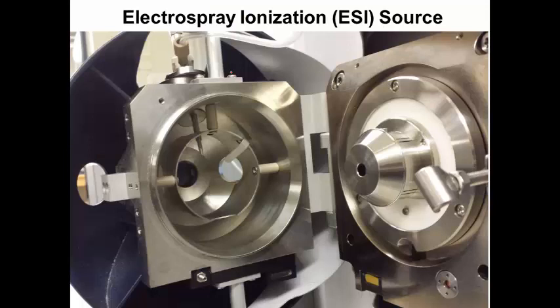If we open the cover, this is what you'll see. The sample would be introduced right at this point here and it's going to travel down a short needle where it's ejected from that tip. When this is closed, that needle would be positioned right about here, and this hole is the entrance to the mass spectrometer. There's a tube leading that travels down to ultimately reach the flight tube.